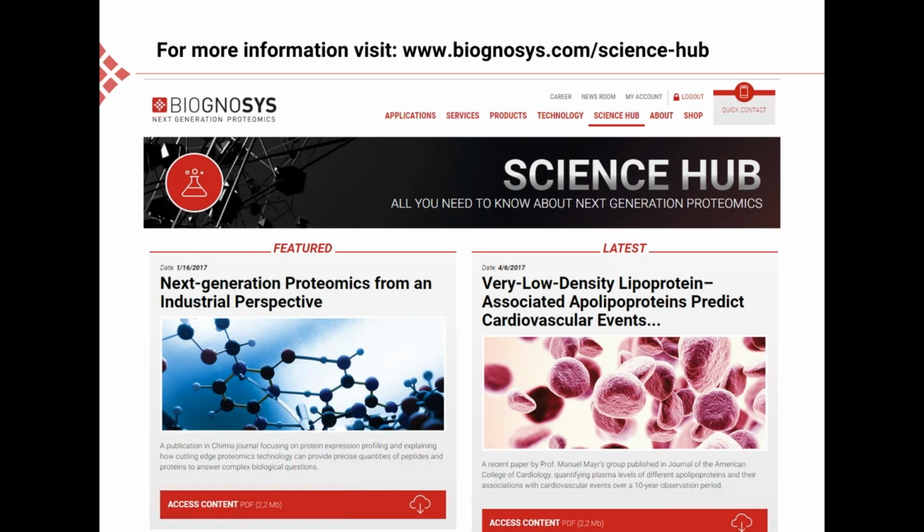I can add a little comment about the spectral library generation and the work of the IRT peptides in general in SpectroDive and SpectroNaut. Especially in SpectroNaut, all the IRT peptides are always used in a so-called three-pass analysis, where the first IRT calibration is done based on the IRT peptides.